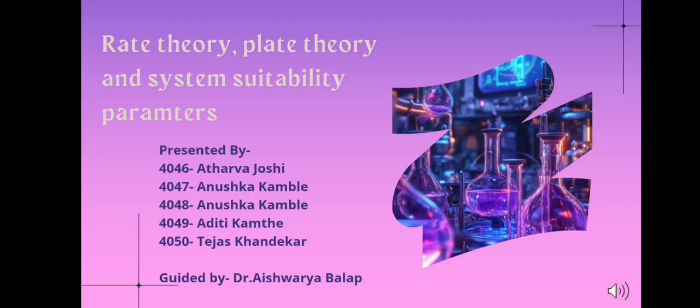Hello everyone. Today we are going to learn about the rate theory, the plate theory and system suitability parameters.